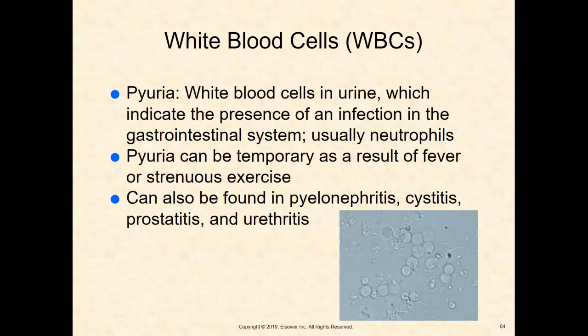These look different than the red cells in the fact that they are kind of glittery. Okay, so when you see them in real life, especially in a urine that's got a low specific gravity, they actually kind of shine and sparkle, and you can see they look a little bit grainy. These will actually be sparkly underneath the microscope.